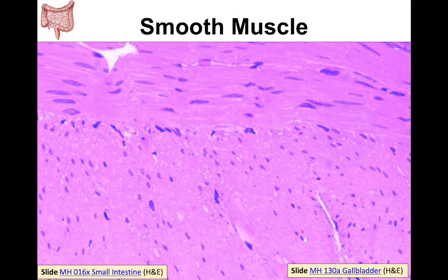Let us see smooth muscle. Here we have both a longitudinal and transverse section of a smooth muscle. As you see in the longitudinal section, there are no striations. And the nuclei appear lighter in staining. The nuclei contain lots of euchromatin, so due to that they appear lighter. And as you know from lecture, smooth muscle contracts from every direction.